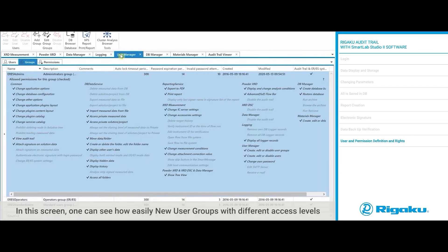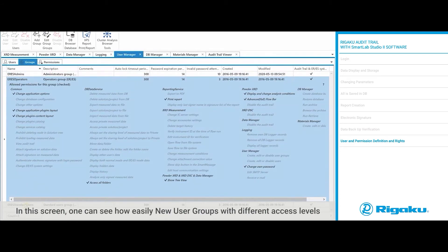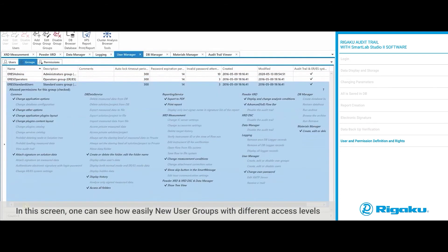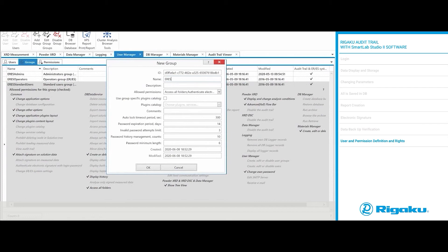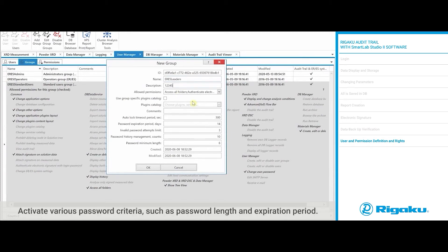In this screen, one can see how easily new user groups with different access levels can be generated by an authorized person. Enter a name and a description for the audit trailing. Activate various password criteria such as password length and expiration period.